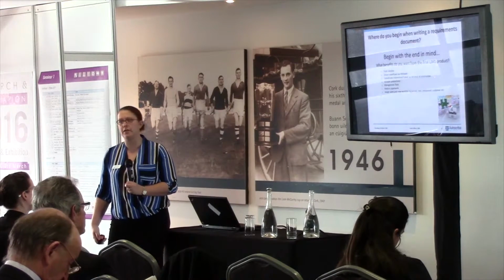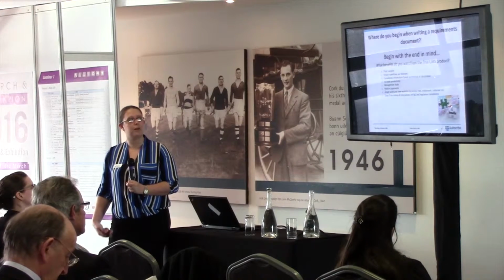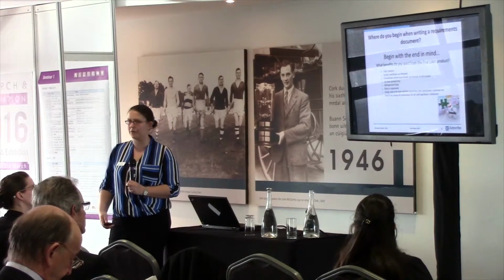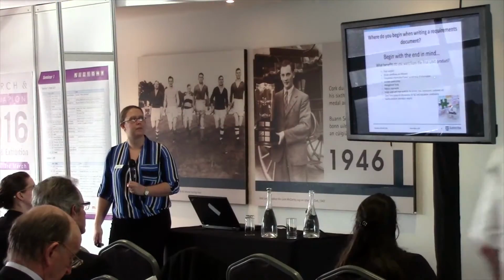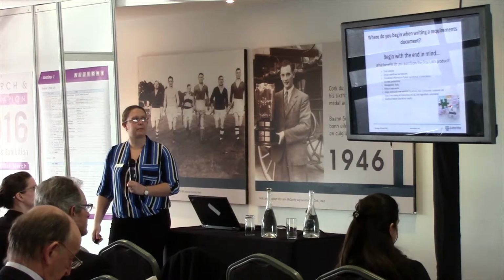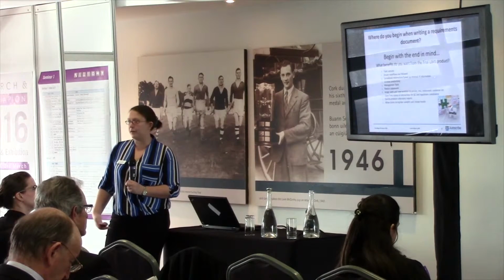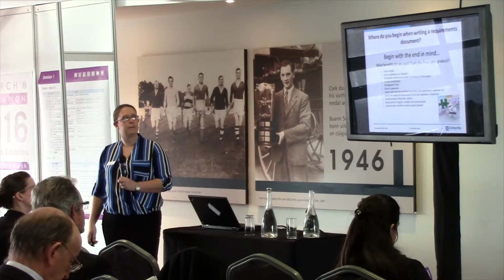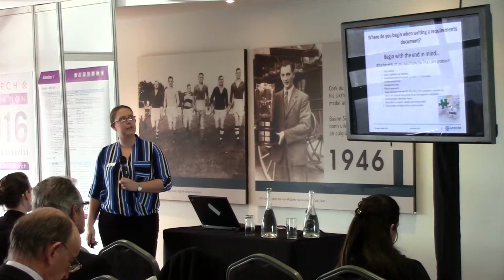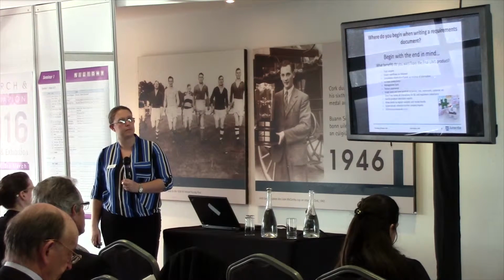Do you need the system to assign work to certain people? Would this be helpful to you? What needs date and time stamping? Does everything in the system need to do that, or just a few things need date and time stamping? Which reports do you need? Do you need external clients to be able to actually register samples? Do you need to be able to schedule things automatically? These are all the sorts of things that you really need to start looking at when putting together one of these documents.